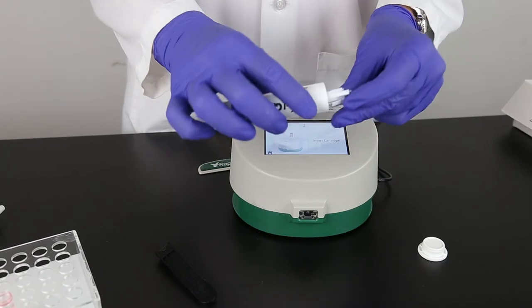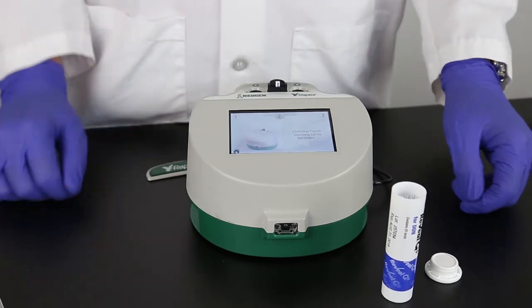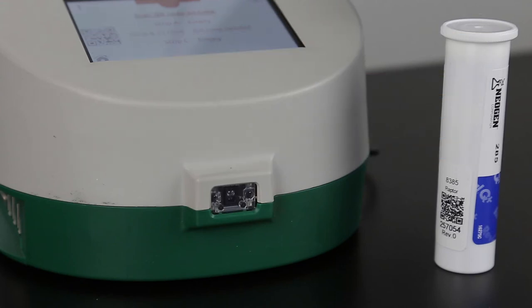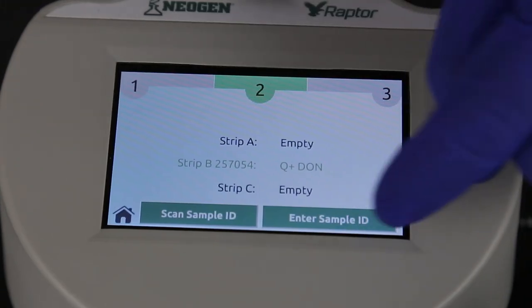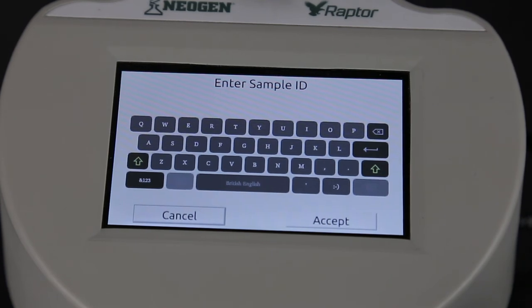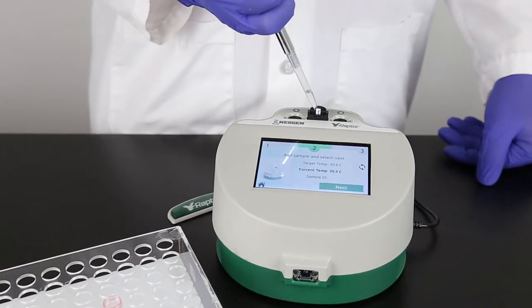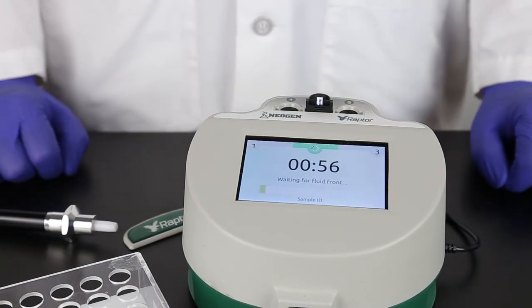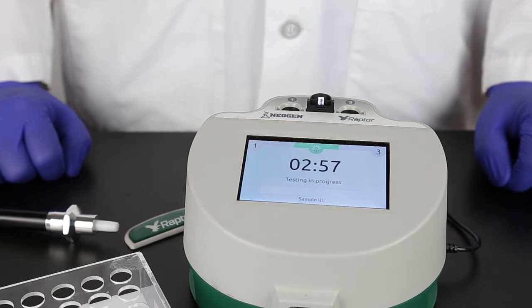Place a test strip into the Raptor cartridge. Place the cartridge in the Raptor system — you can use any of the three ports. The Raptor system reads the barcode on the strip. If you need to add the lot information to the system, the scanner on the front of the system will turn on automatically. Scan the QR code located on the strip tube. Enter a sample ID if you like; this can be done manually or by using the scanner in front of the system. Pipette 400 microliters of sample into the Raptor cartridge. The system and timer will start as soon as it detects the fluid front on the sample strip. You can now start samples in the other two ports on the Raptor. Each port operates independently.